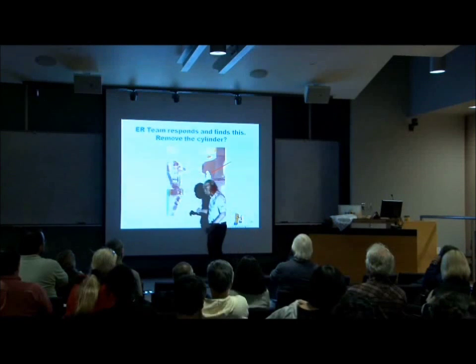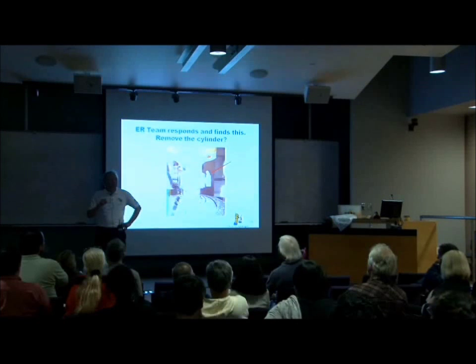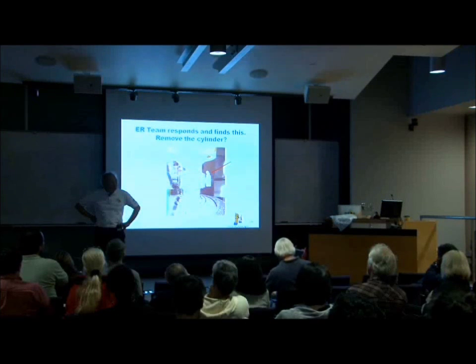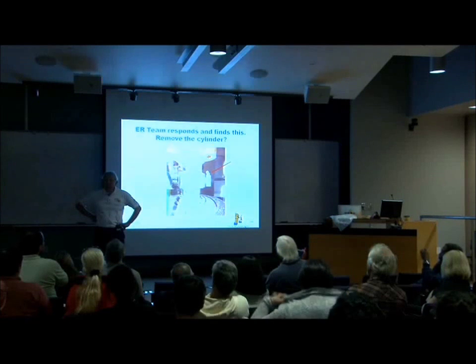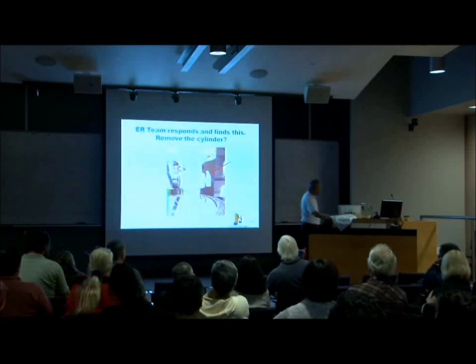Now, why is this important to you? It's important to you because this is one of the safety inspection things you should do when you do your walk around. Why is it important for UC? When I did the training class up at UCI, they asked me to walk around and take a look. And I found a hydrogen cylinder with an extruded pressure relief device that was ready to activate, sitting in a laboratory. Okay, I have a picture of it. I'll show you, I don't think I put that particular picture in.